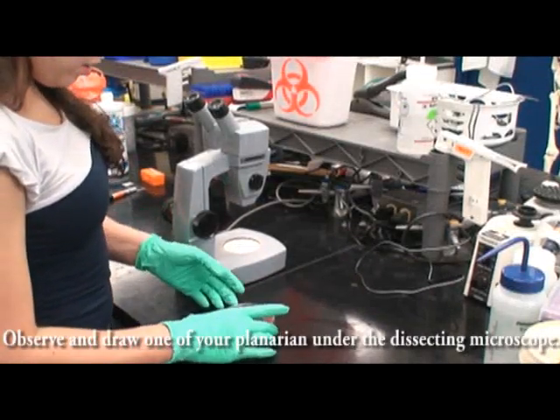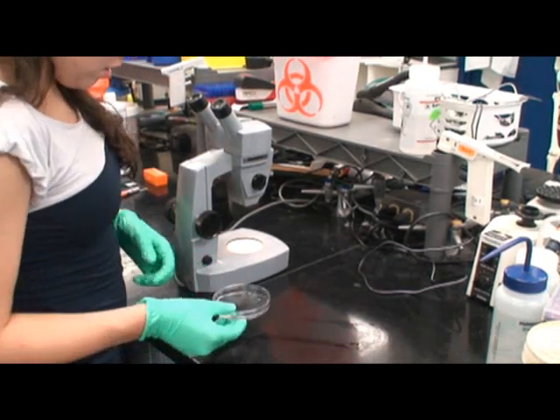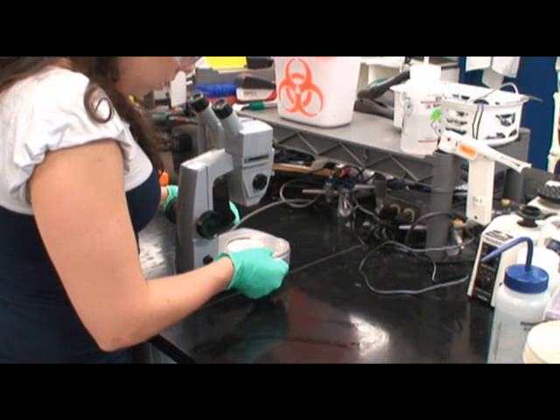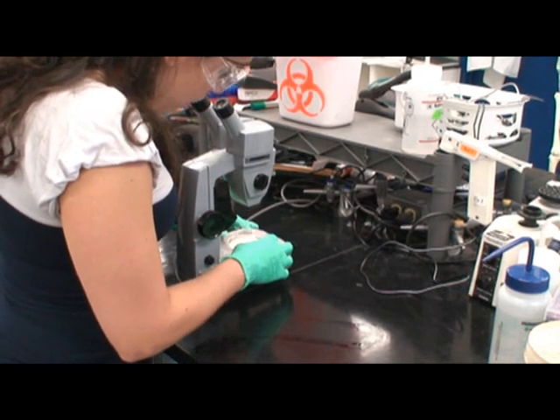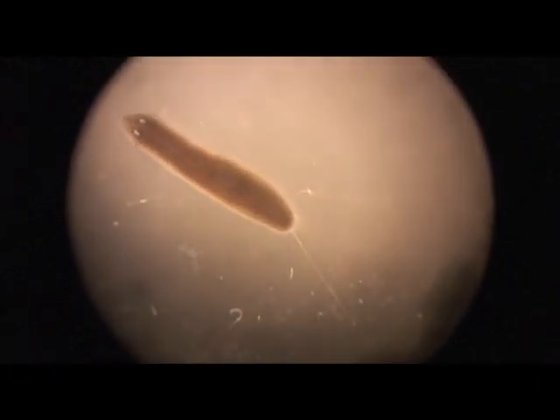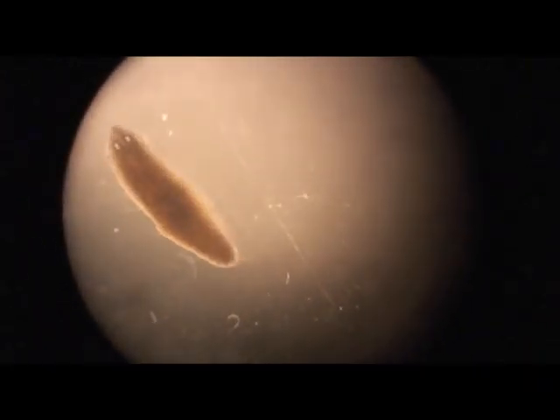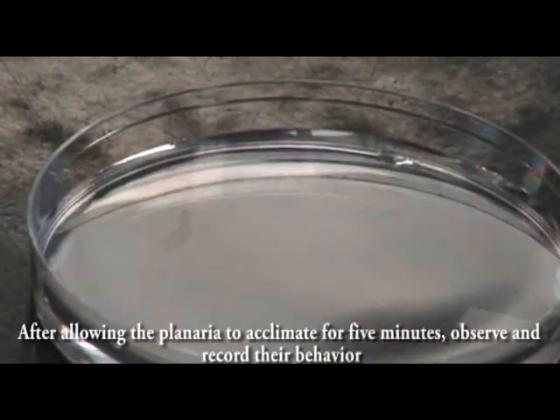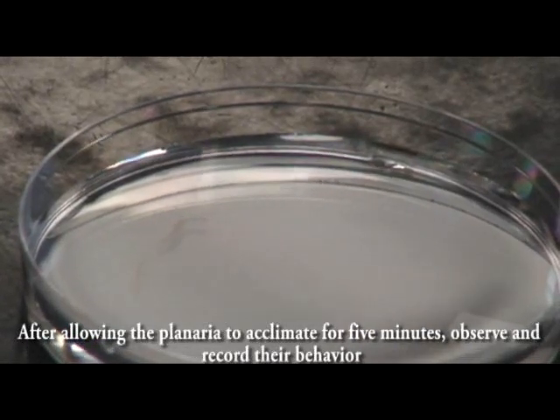Observe and draw one of your planaria under the dissecting microscope. After allowing the planaria to acclimate for five minutes, observe and record their behavior.